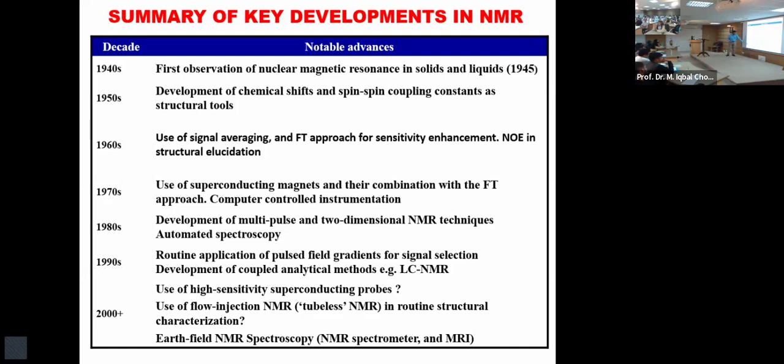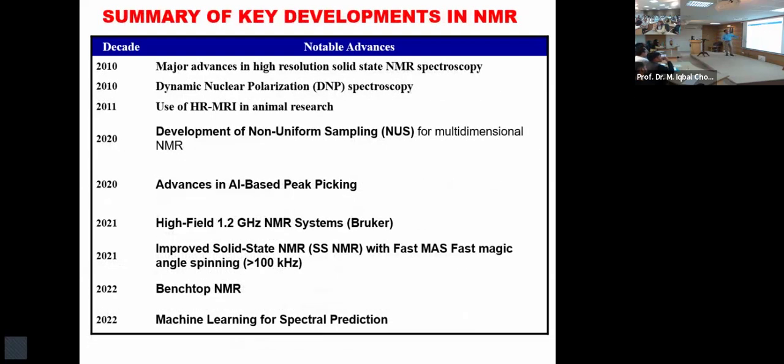And then gradient use and highly sensitive superconducting probes were developed. You would see superconducting probes here in our institute, and major advances in high resolution NMR.